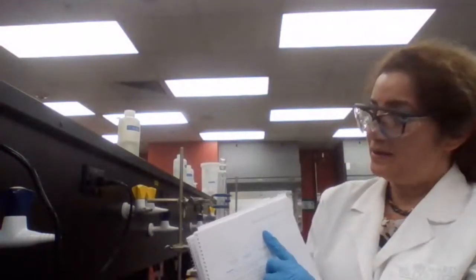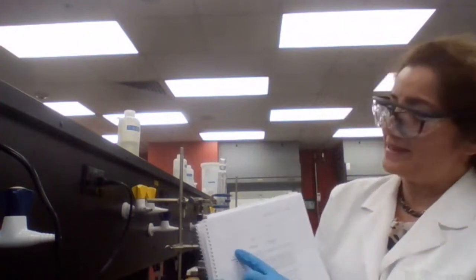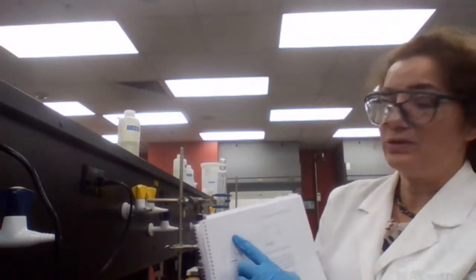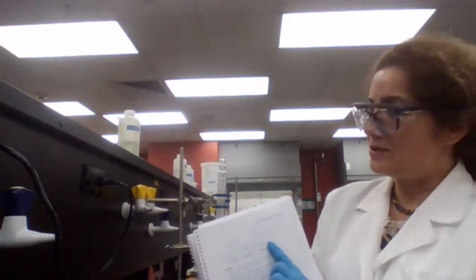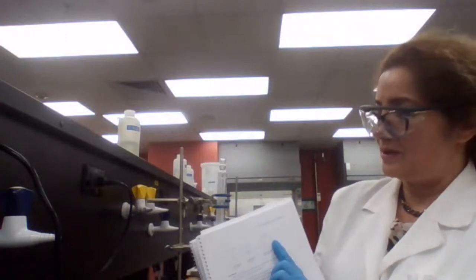Okay, 1715. Ester, if it's not conjugated, is going to have a peak at 1730 to 1740. So basically, the location of the CO double bond peak is going to shift from 1715 to 1730, 1735, or 1740, depending on the environment of that CO double bond. Then it's going to change.